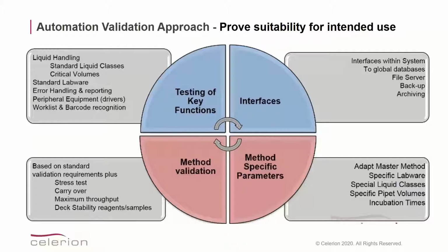Although the methods are mostly based on a master method, used for the validation of the system in the upper blue section, method-specific adaptations of liquid classes or labware may be required and be part of the bioanalytical method validation later. So now it's a pleasure for me to hand over to Rebecca.